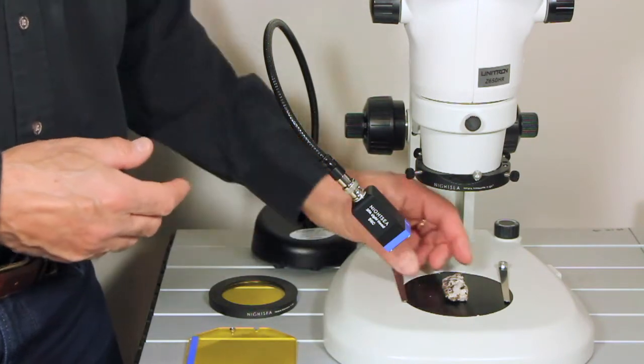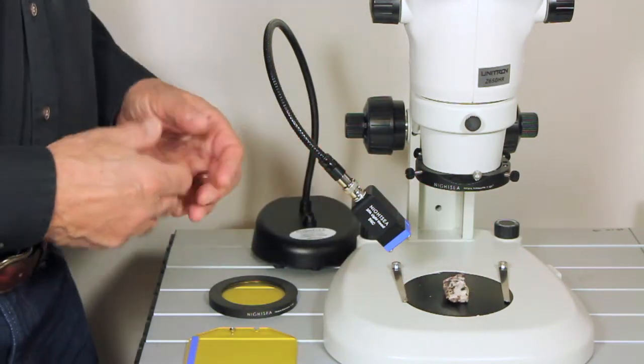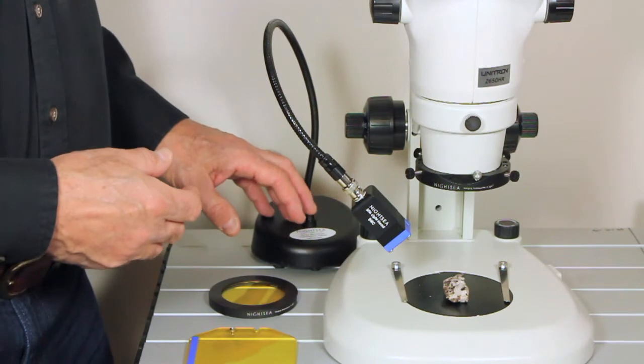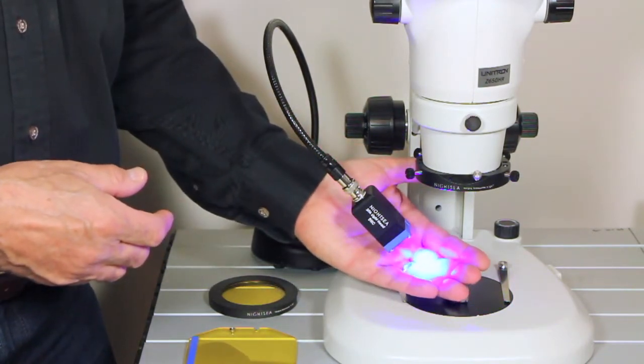We're going to demonstrate with our pet rock here from New Jersey. Fluorescence comes down to excitation and emission.